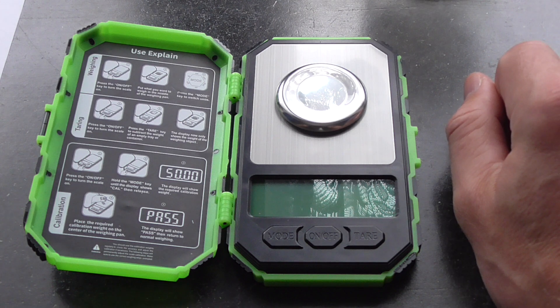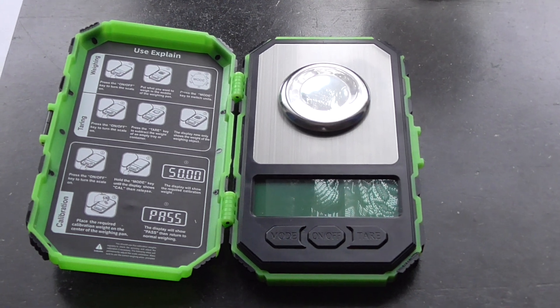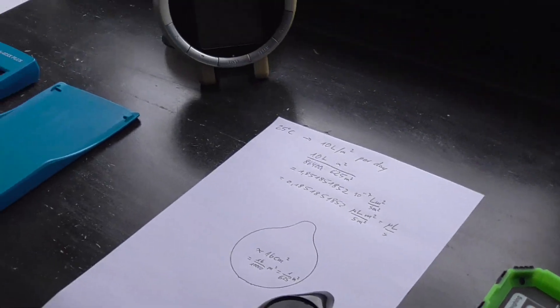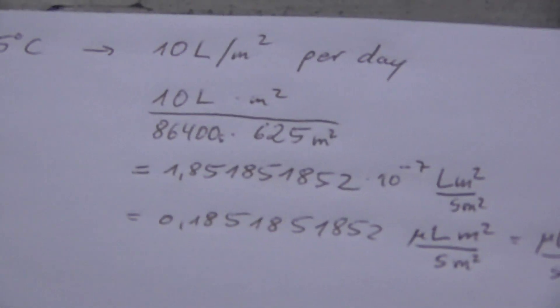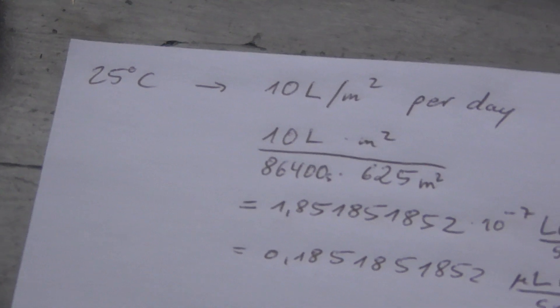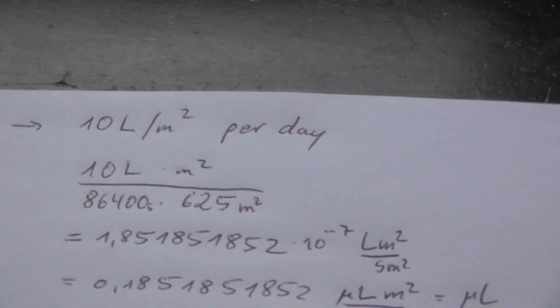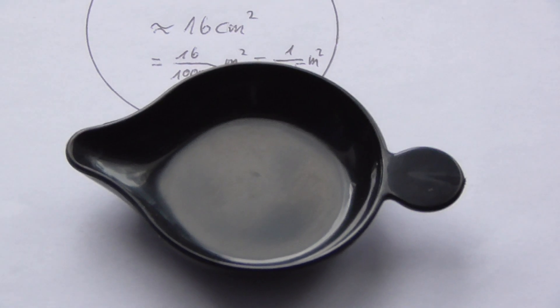I have to take some things into account because water can evaporate over time and its density is dependent on temperature. I looked up some values and found that at 25 degrees Celsius — which is currently the case here — water evaporates at a rate of 0.185 microliters per second. This is for a surface of about 16 square centimeters, which is the bucket surface where I'll put the water, and this bucket I will put on the scale.